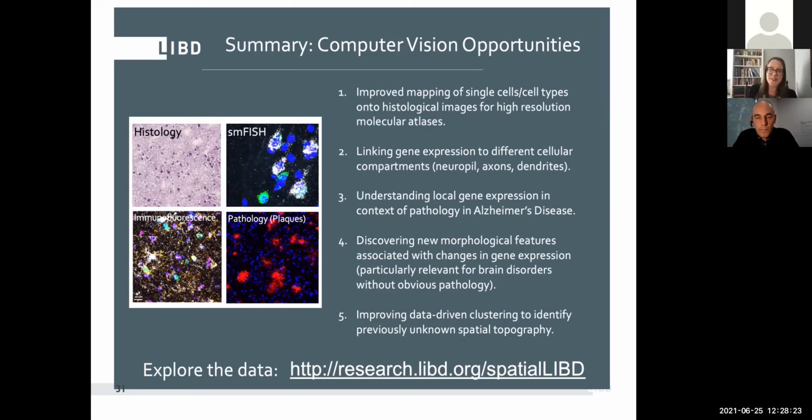Yeah, that's a great question, very relevant, and something I think that people are grappling with as new developments come to the technology. So right now, in terms of computational tools, there's quite a lot of focus on this deconvolution approach. So how you can try and break that spot out into smaller spots, or using the histology data, know how many cells are in there based on the morphology, maybe try and correlate that with whether it's an excitatory neuron or inhibitory neuron.